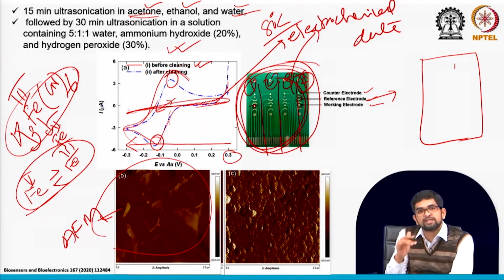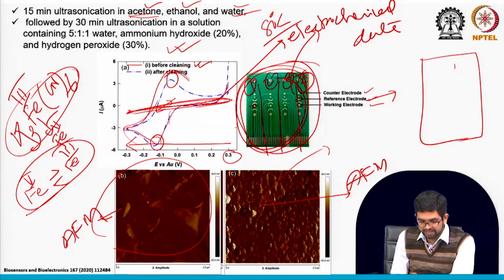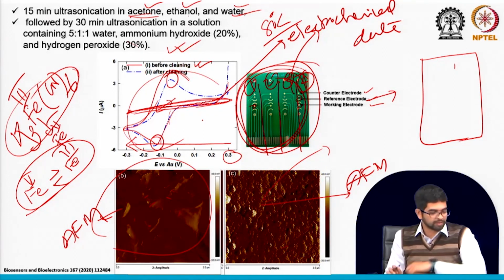You can see how much contaminant there is, and this is the AFM image again. See, just after cleaning, the surface is almost exposed. Now the outer surface is the gold, but before that there was not much gold. That is why you can see almost no current and no peak. But when you clean the surface by this method, you can see a very good peak. This is very good information when you use PCB electrodes for biosensor development.